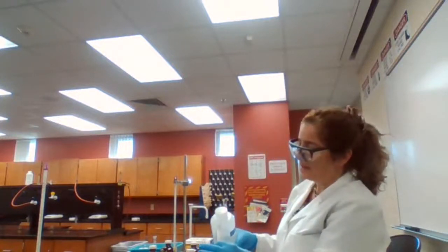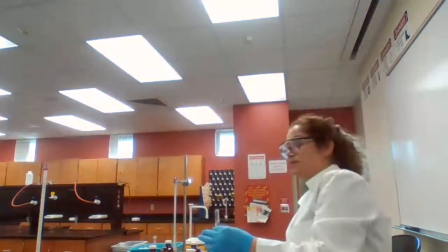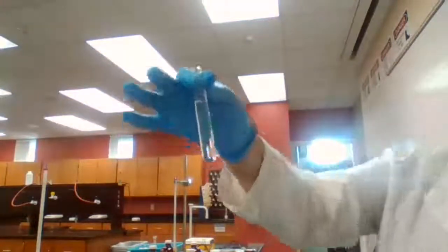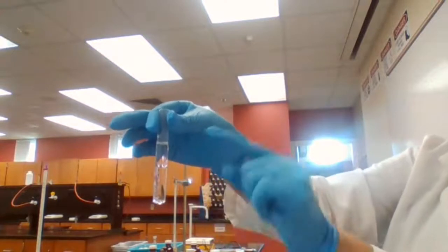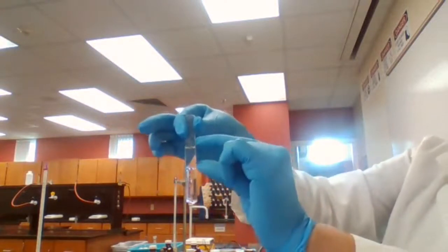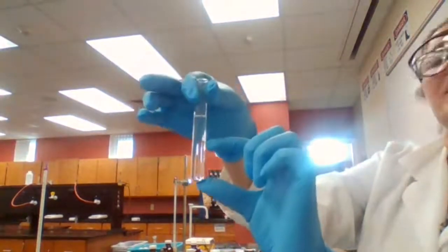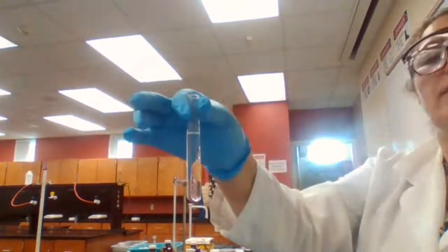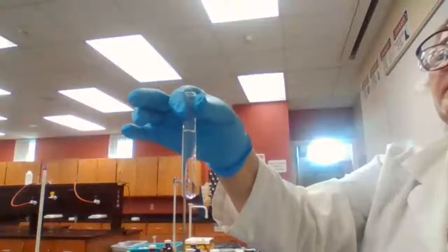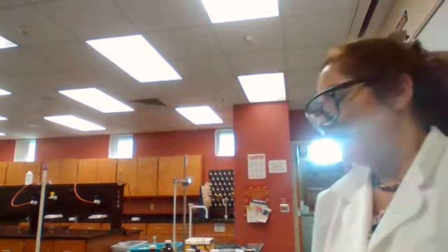Pentane in water, so I have pentane in the test tube, I'm adding water. Now, it would be very easy for you to see if you were in the lab, but there's a line here, the top layer, bottom layer. Pentane has lower density and water has higher density. So the bottom layer is water, the top layer is pentane. And it didn't mix, it didn't dissolve. You have two layers. Okay.